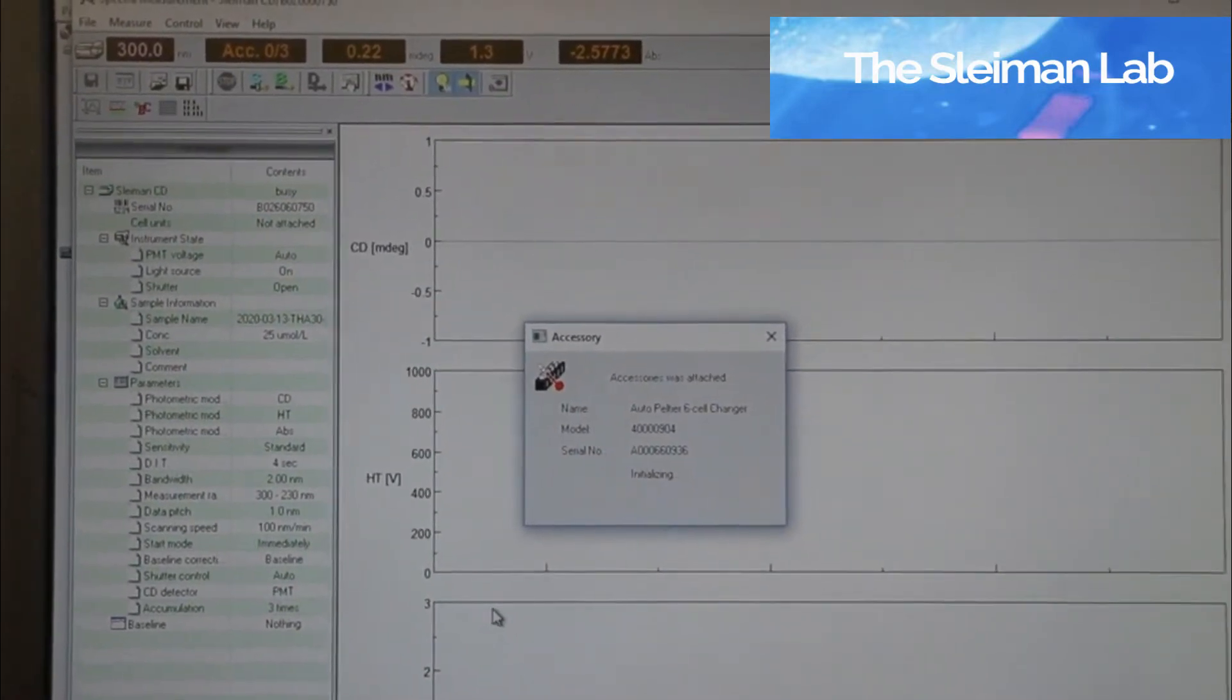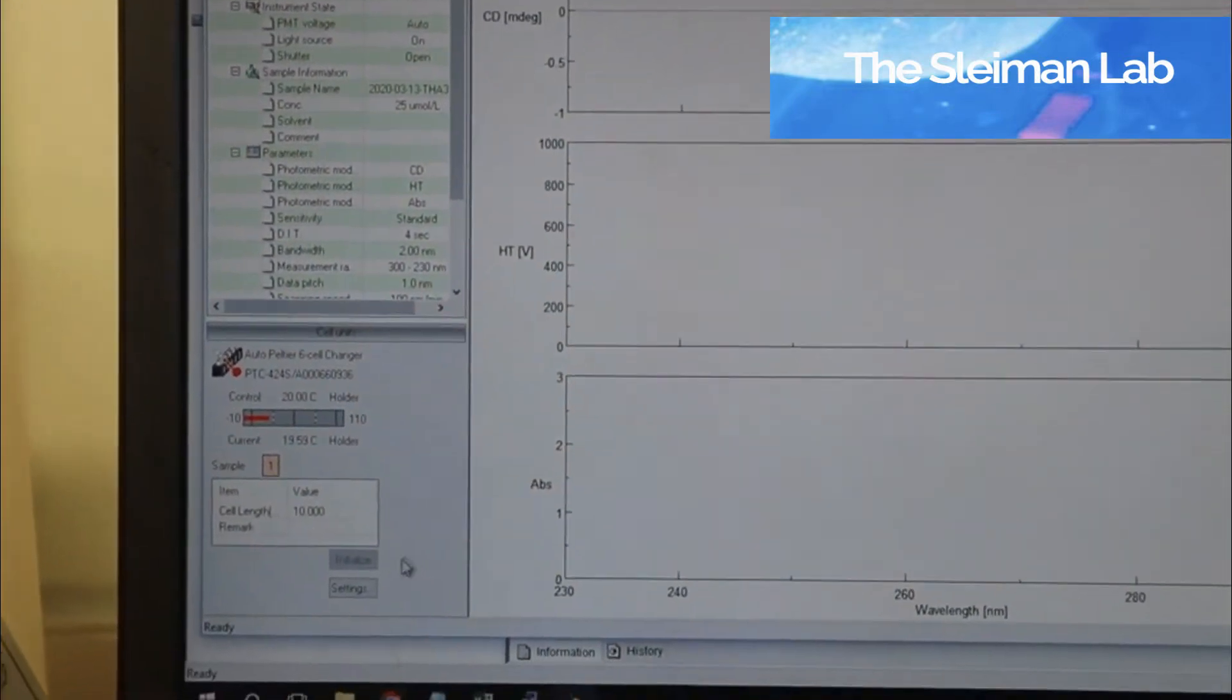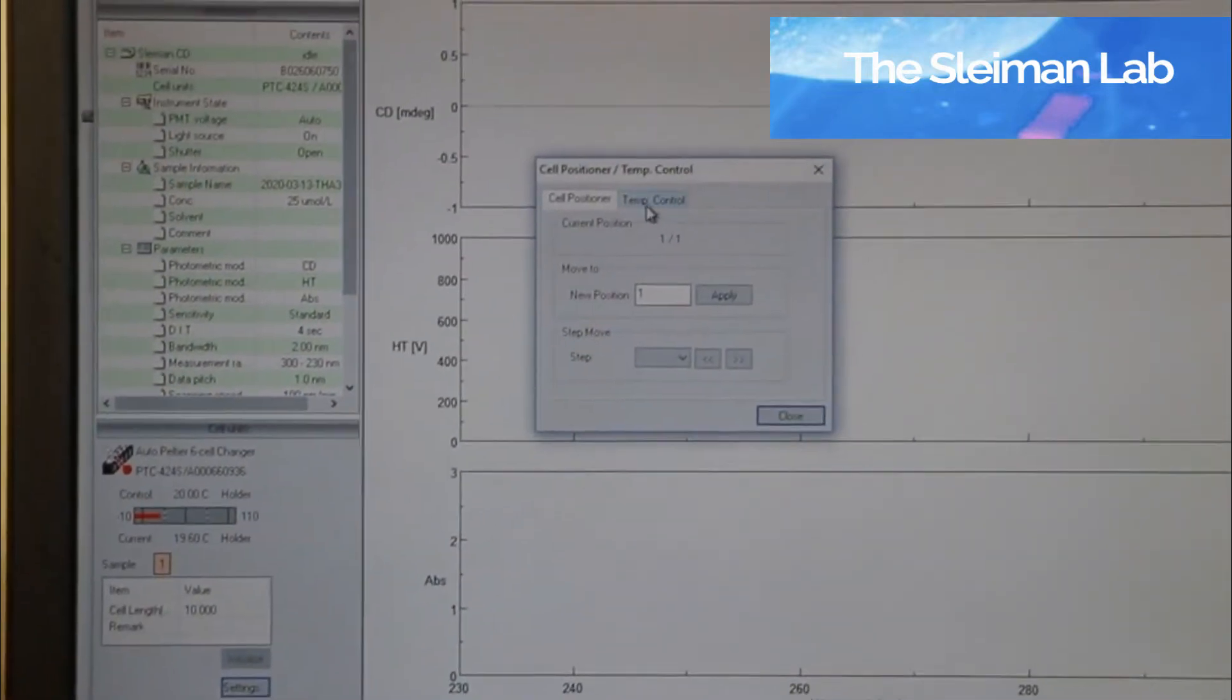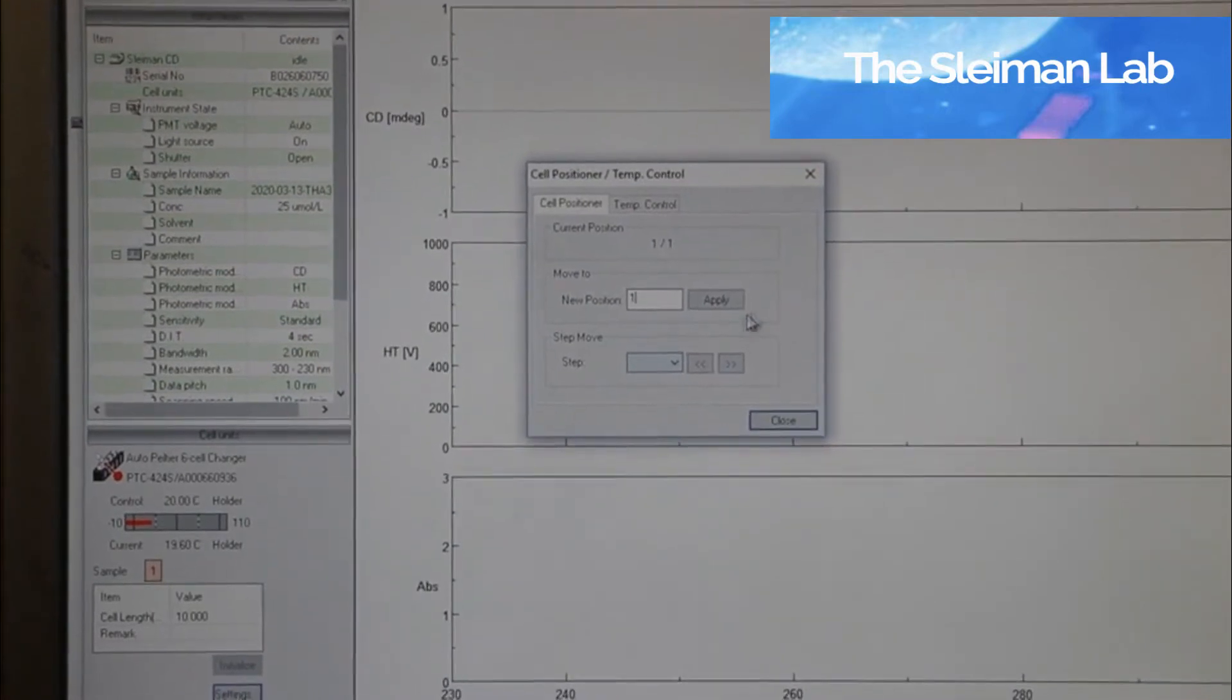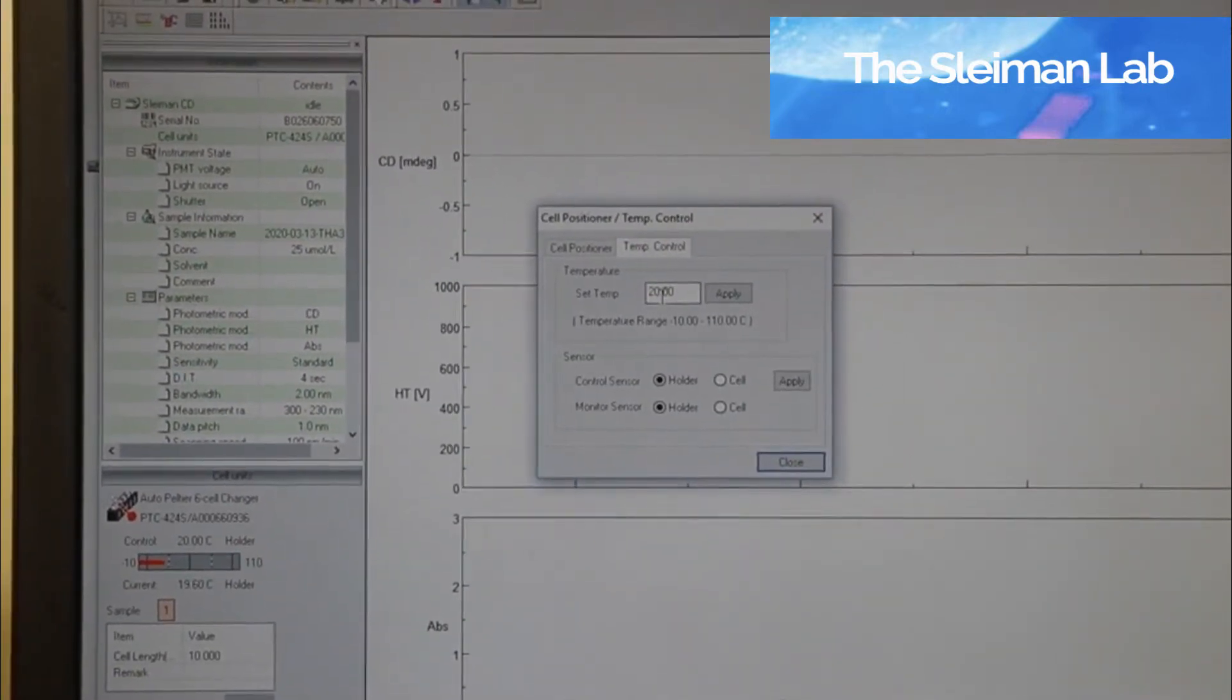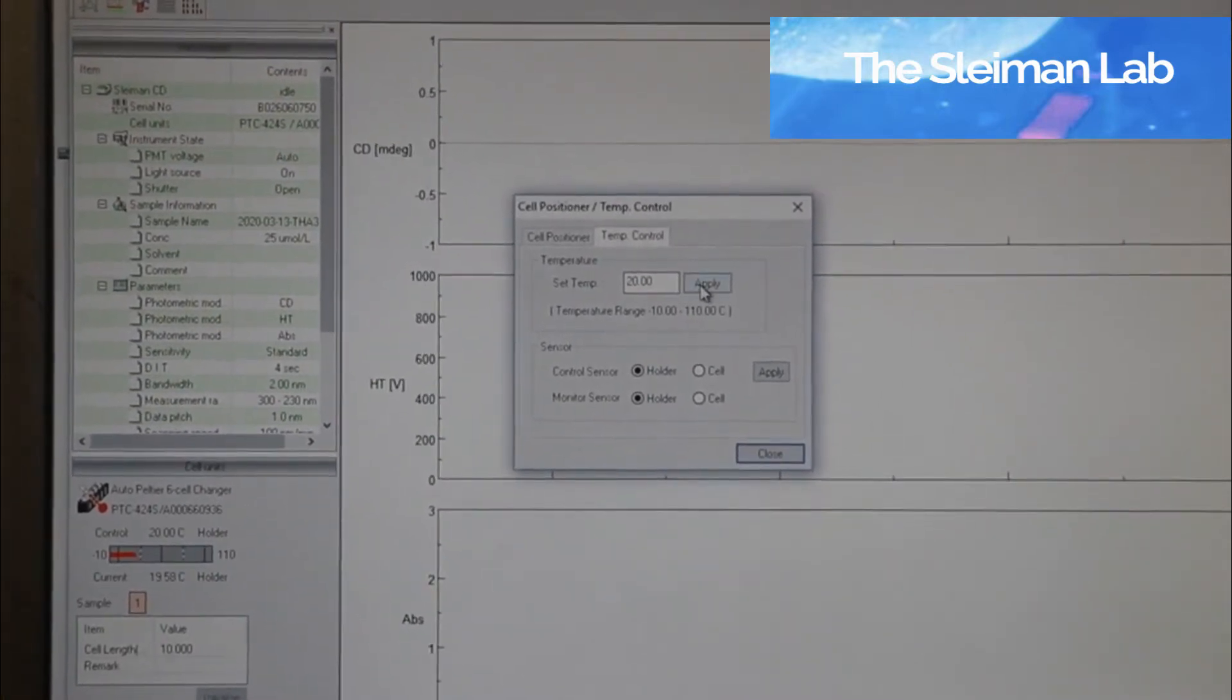A window will appear here on the bottom left corner. This window allows you to control which cell you will be measuring. We will be measuring cell 1, and which temperature you want to do your measurement. We'll be running your temperature at 20 degrees.